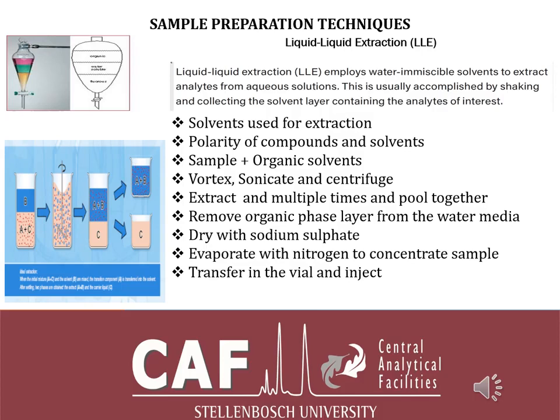And also, just briefly, in more detail: you've got a sample and an organic solvent, and you add a certain volume of your organic solvent and shake the sample for a few seconds, maybe 30 seconds to a minute. Then you put it in an ultrasonic bath, or you can use a shaker, so that your compound of interest goes into the organic phase. If you're using separating funnels, it's always important to remember to release the pressure every now and then from the top stopper.